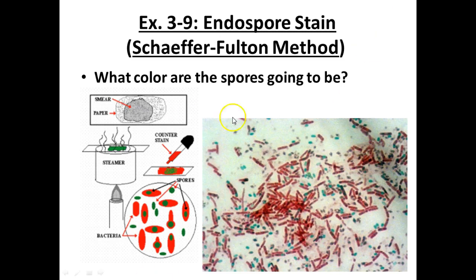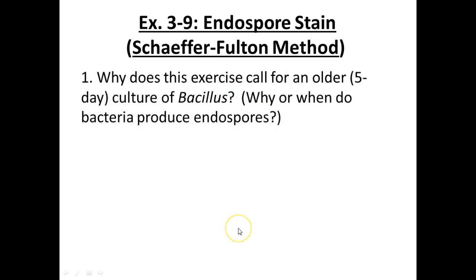Hopefully you'll see something like this. Notice the spores aren't inside the cells, they're all over the place. Green or bluish green.